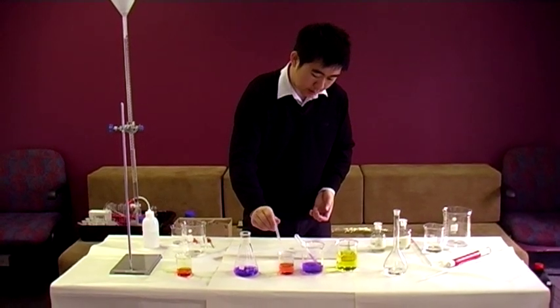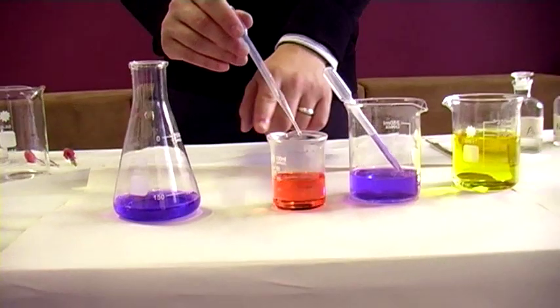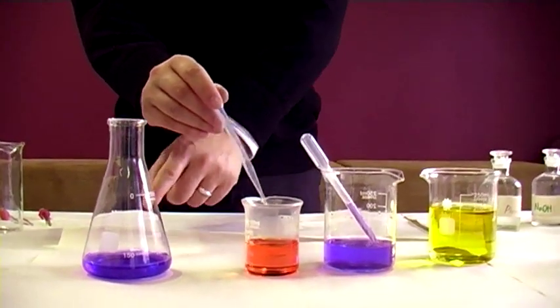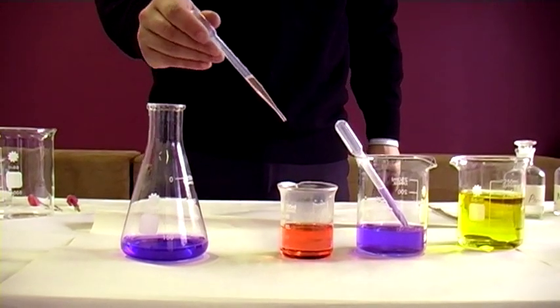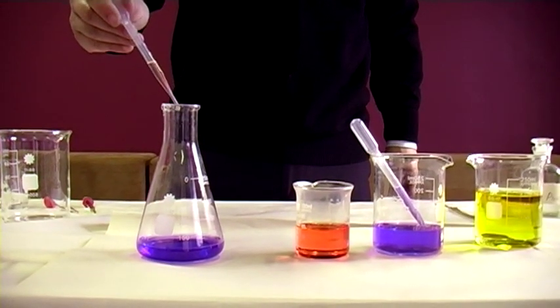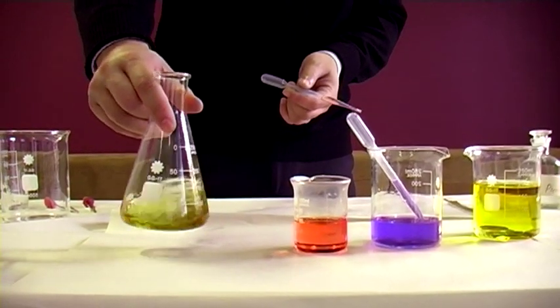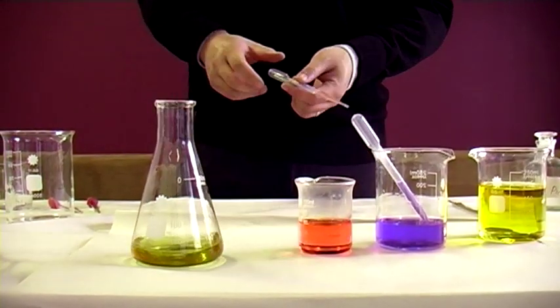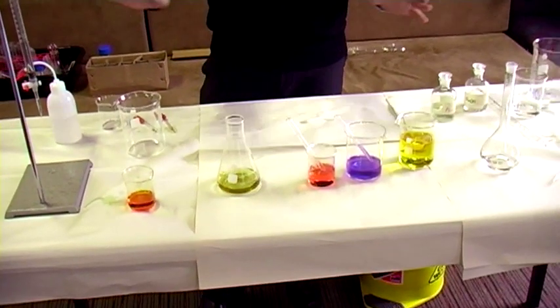What we have here is an acid, around the same concentration as my base. My acid and my base, and the indicator is bromothymol blue. I'm just going to add a drop. That should be what you're looking for when you're doing a titration — that single drop that changes the colour of your entire indicator.